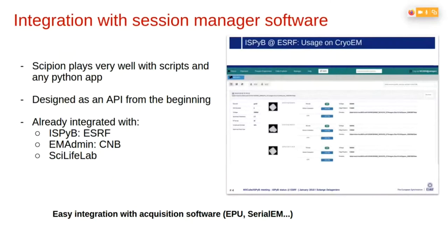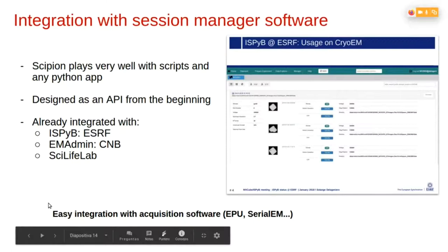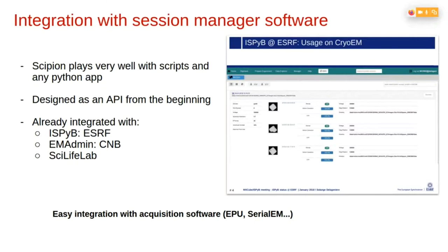Well, now let's see how Scipion can be integrated with your session manager software. Scipion is coded in Python, and Python is very scripting friendly. And in addition, Scipion was designed as an API from the beginning. So this makes integration with your session manager software quite easy.